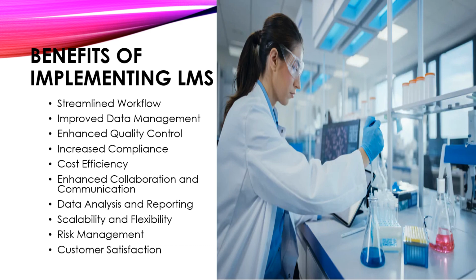Enhanced collaboration and communication. A laboratory management system facilitates seamless collaboration among laboratory staff, departments, and external stakeholders. It enables real-time sharing of data, results, and insights, fostering collaboration and improving communication within the organization and with clients or partners.